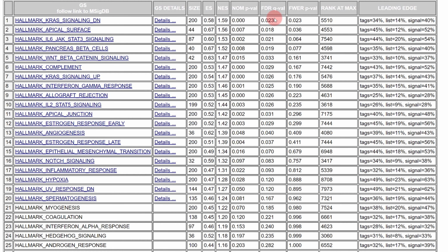The family-wise error rate p-value is really a statistic which the software used initially in its first iterations, but then the researchers developed their algorithm and their statistics, and so they don't recommend using that anymore, but they keep it in just in case you want to look at it.